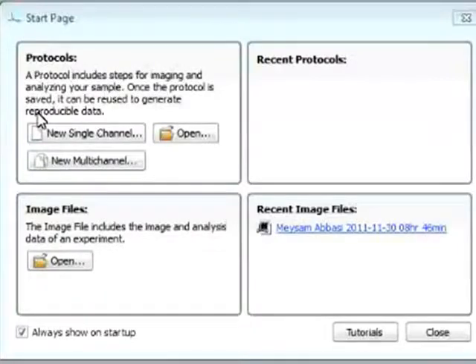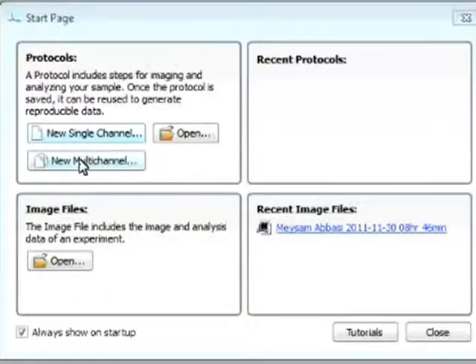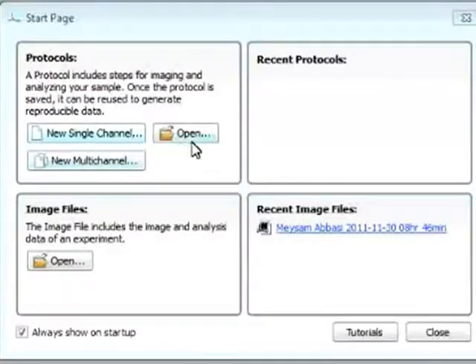So in protocols, we can select from new single channel protocol or new multi-channel protocol, or we can open a previously saved protocol.